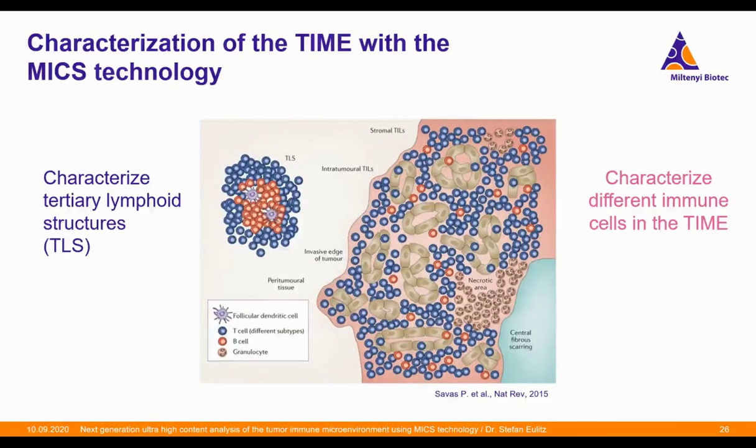So let's move to the next example I would like to show you today, which includes also many findings from the last years and proves the power of the technology, since you can see all these great work done in the past just in one experiment. You will now see a second ovarian cancer sample where we have characterized the tumor immune microenvironment.